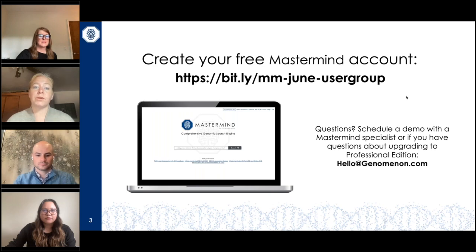So what we're going to show you is every other variant at that same position. She covered how to use search in that table by variant type. You can also just put in a number. So again, if I searched by c.127C>T, I can go down into that search bar and say, I'm looking for any other changes at c.127, and that will get you basically search by location.